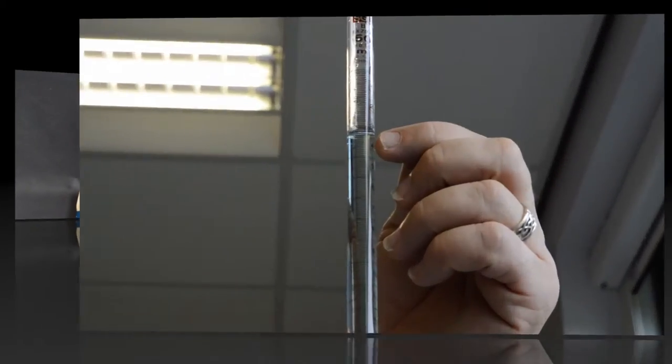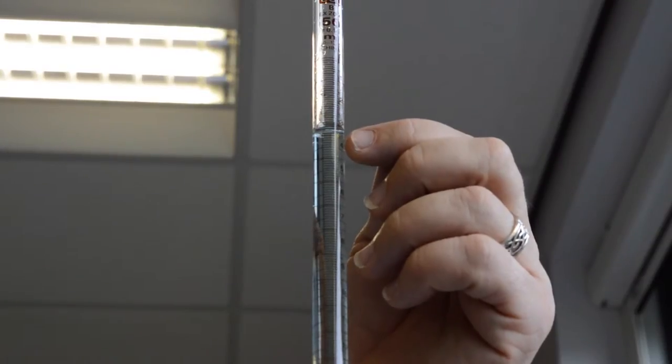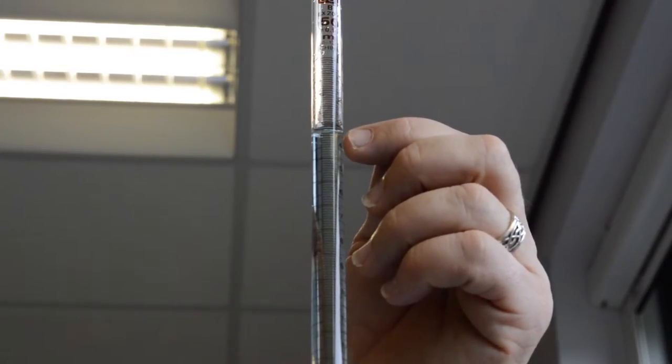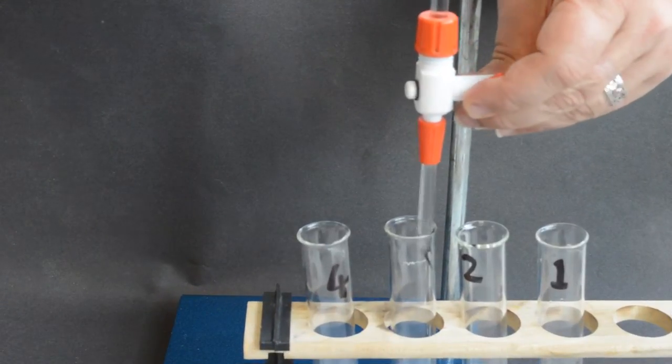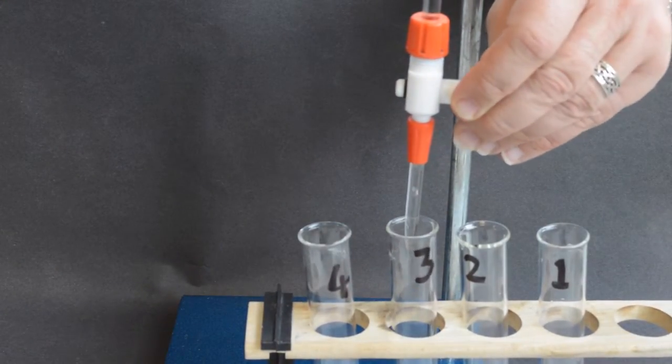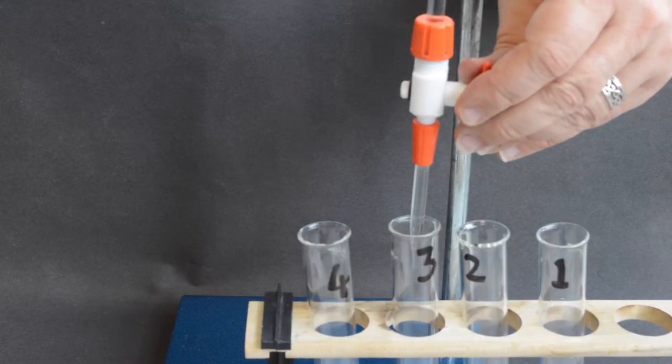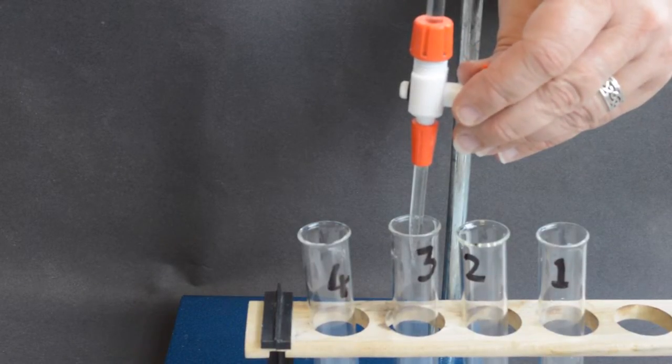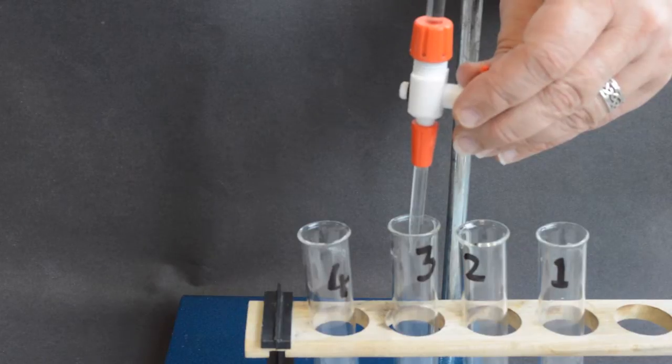Note the volume of copper sulfate remaining in the burette. Repeat this step with tube number three, adding three milliliters of copper sulfate to this tube, and continue through tubes four to nine, adding increasing volumes of copper sulfate to each tube.